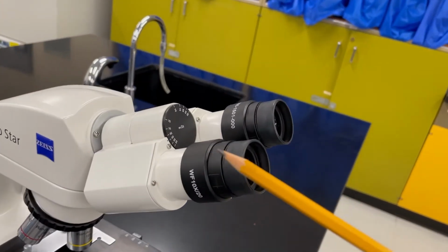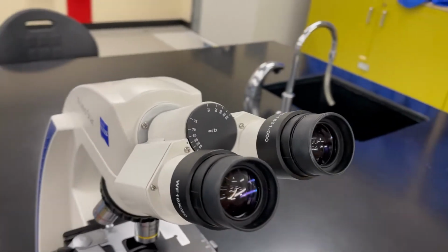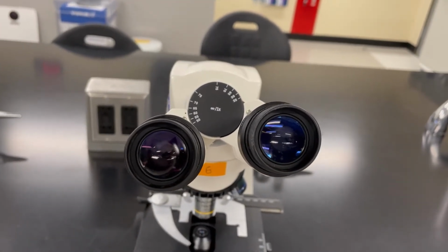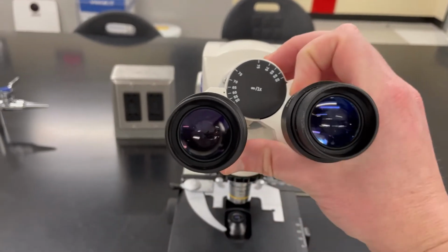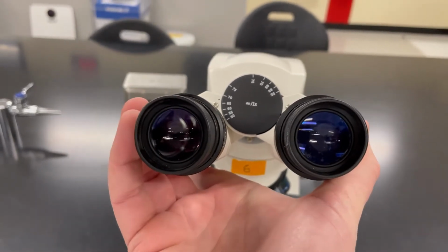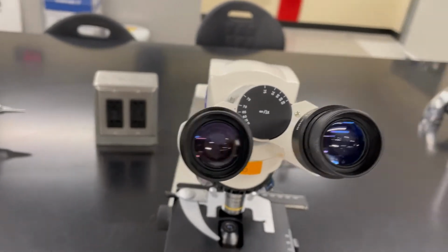So up here we have the ocular lenses, or the eyepieces. In fact, these microscopes have 2 for binocular vision, and what that can do is actually give you a bit of a better view, a little bit of a stereoscopic view. 2 eyes are better than 1. You can see these eyepieces, they will actually move apart or closer together. Kind of just depends on what's comfortable for you and your eyes. So these here are a 10 times magnification.